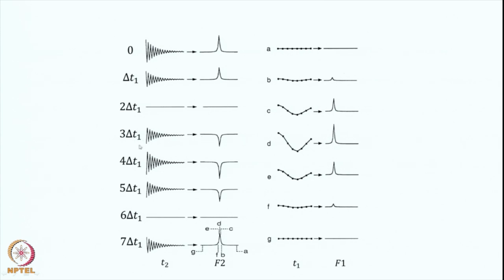Now for the third FID, and the fourth FID, it is starting negative and the signal is now inverted. So it is going negative here, and this fourth point is also negative, but with enhanced intensity because this initial point is higher than the previous one. At 5 delta t1 again it reduces, the 6th one is back to 0, the 7th one is again going positive, this is the positive signal, and so on. So this keeps getting modulated. The signal here is getting modulated by the evolution during the period T1.